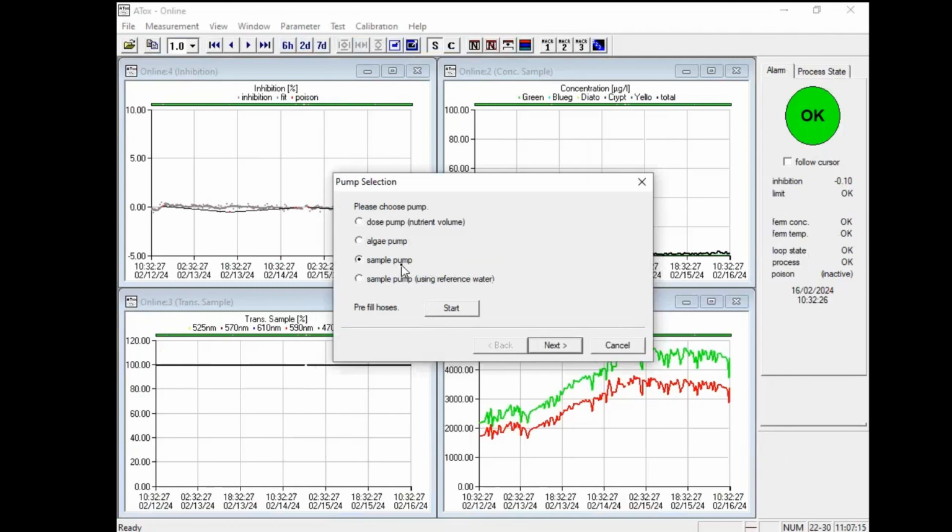Maybe if you have a blockage in the tube system, your pump calibration will fail because you don't have 100 milliliters or 1,000 milliliters or whatever. If you have only 500 or 50 or whatever, and it's a strange different value, that means something in your hydraulics in the tube system has changed.